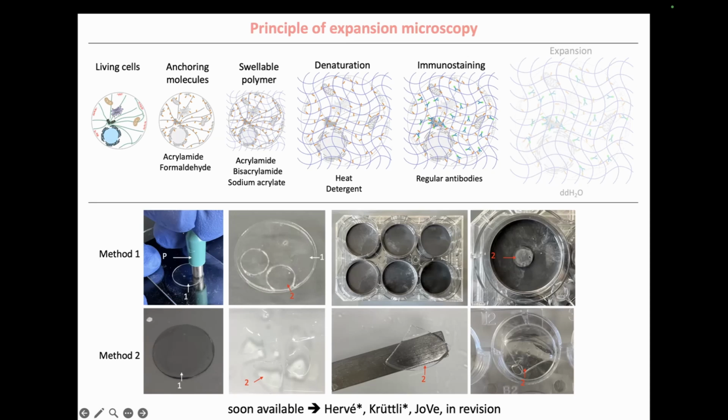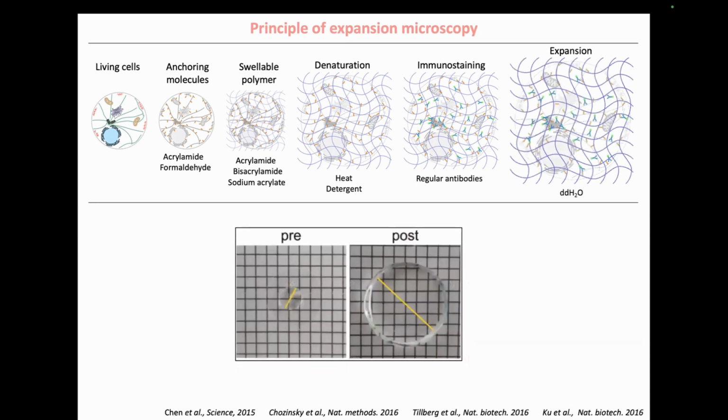It's super convenient also to reduce the amount of antibody. Although you can also cut your gel in little quarters, and it's also a way to reduce. But I really like this strategy personally because it costs less. Of course, expansion microscopy is extremely costly in terms of antibodies, so it's always good to limit. Okay, that was a little parenthesis.